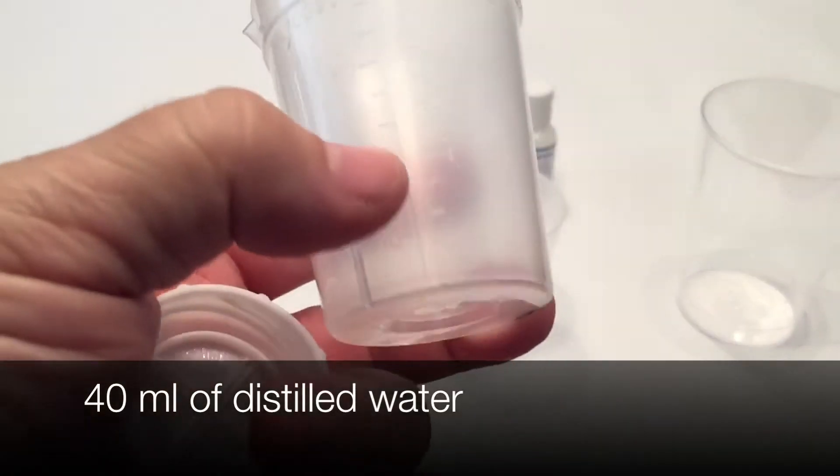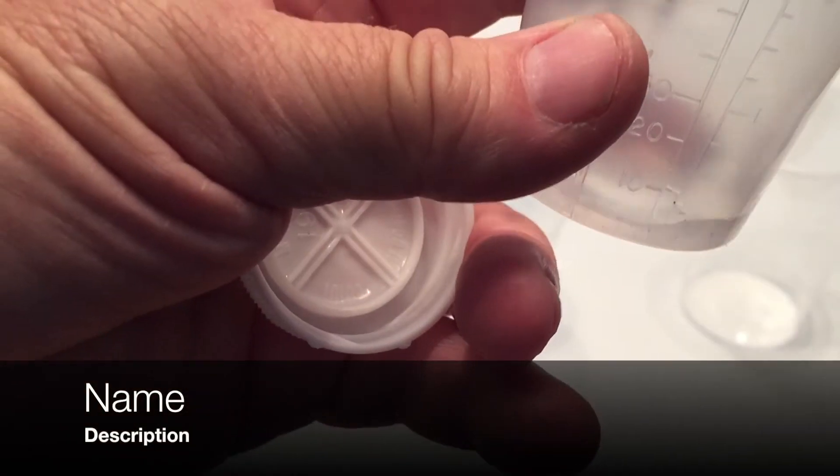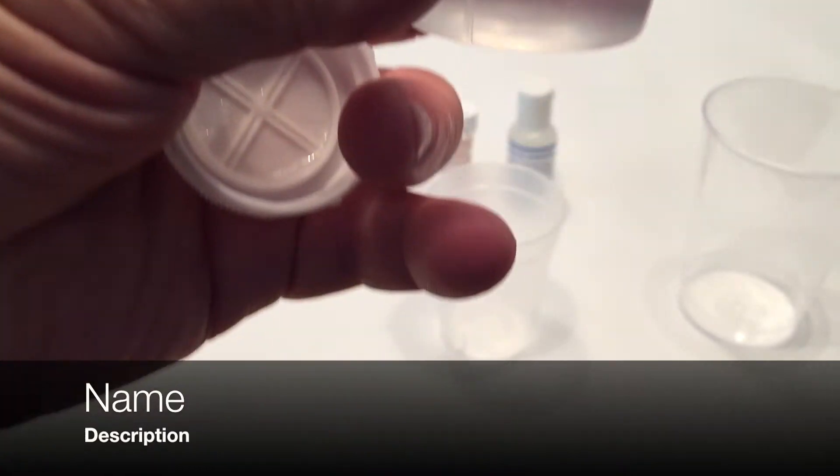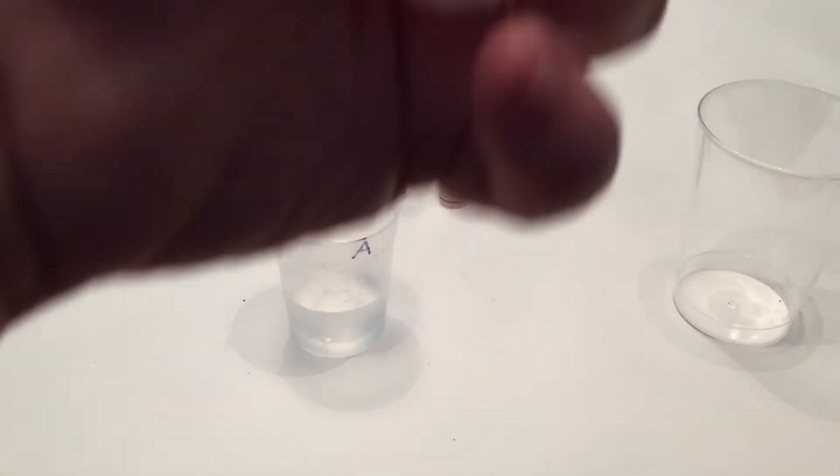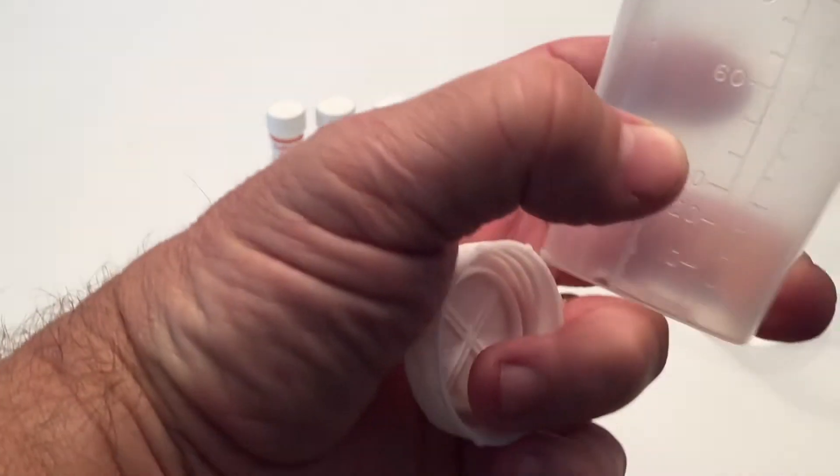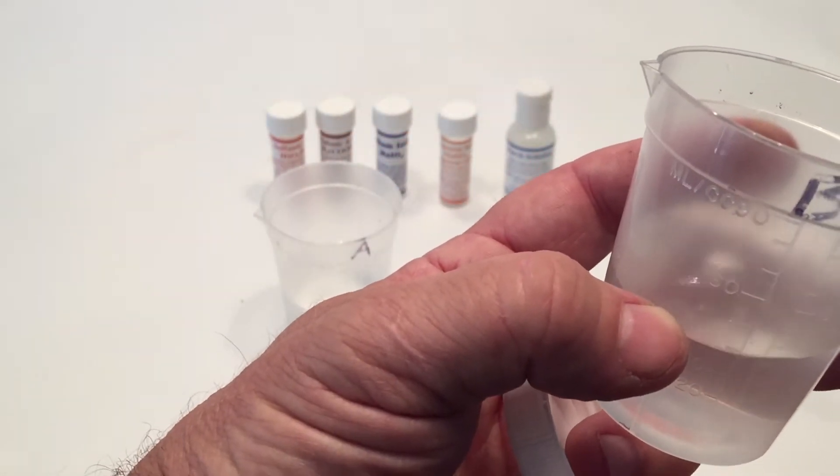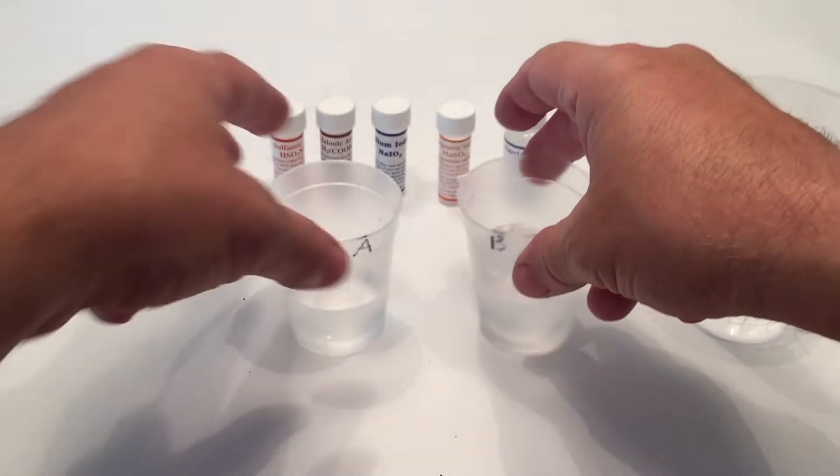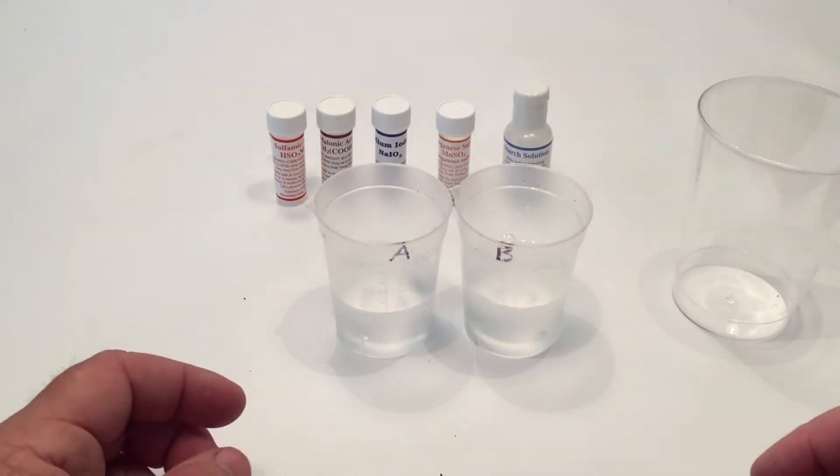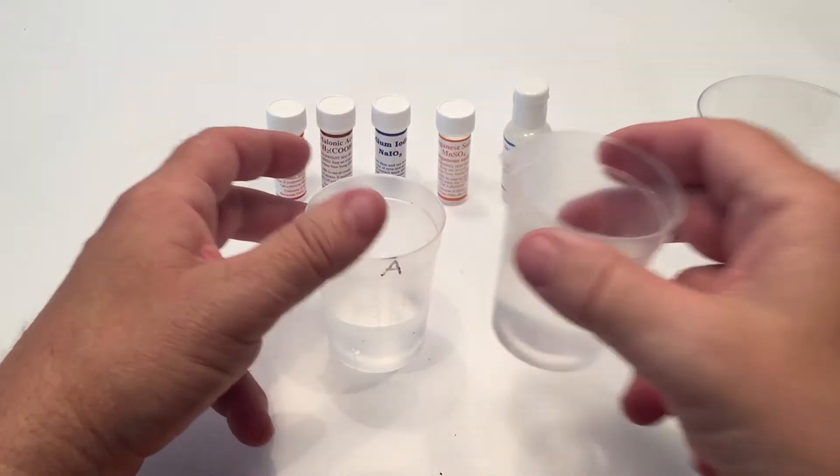This is a really fun experiment. So to set it up, we need to have two different glasses marked A and B because we're going to mix two different solutions together. I'm putting 40 milliliters of distilled water in cup A and in cup B, I'm going to put 40 milliliters of hydrogen peroxide. And then we're going to put some chemicals in each one of them, which I'll be going over that comes in the kit. And then we're going to mix them together and a really cool thing's going to happen that you're going to really love.